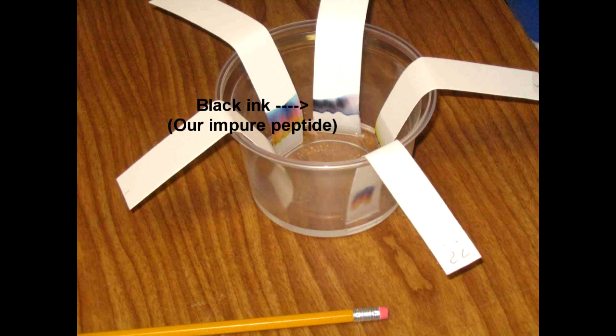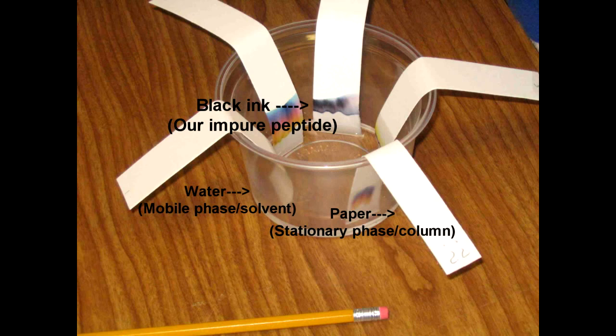The black ink in this case would be our sample, and the paper is the stationary phase, or our column, and the water is the mobile phase, which will assist in moving the sample through the column. On the HPLC, we must include a UV detector so we can discern the different components of our sample. This is similar to our eyes being able to see the different parts of the ink once it is separated.